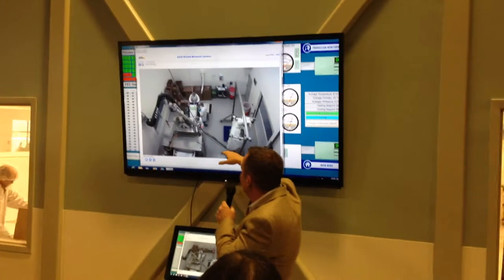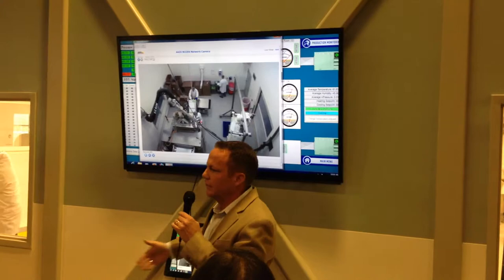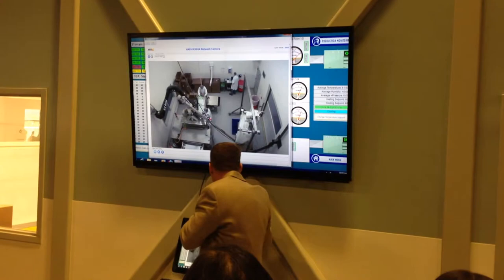You can see the piece of equipment running, which is a cool visual piece for us as managers — we can see where our guys are on this product. If there's an accident or something, we can always go back, and this is recorded and stored that way. So that's our stick-packed sachet machine. We'll go over a few of these to show you our other pieces of equipment.